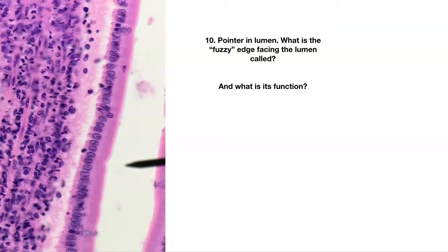Here's a close-up of that slide we just saw. Pointer is in the lumen. Here's kind of a fuzzy border — this edging right there facing the lumen. What is this called? What is this apical modification called right here, and what is its function? You don't need to tell me the type of epithelium — just what is this apical modification called, this fuzzy-looking thing, and what is its function?